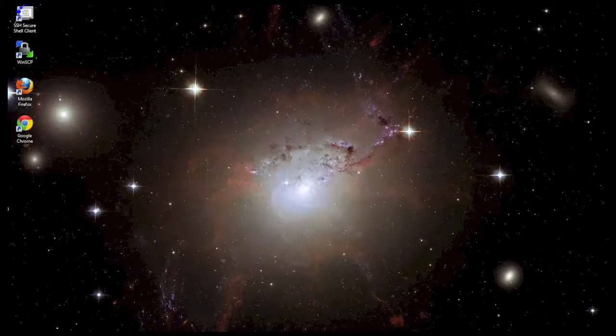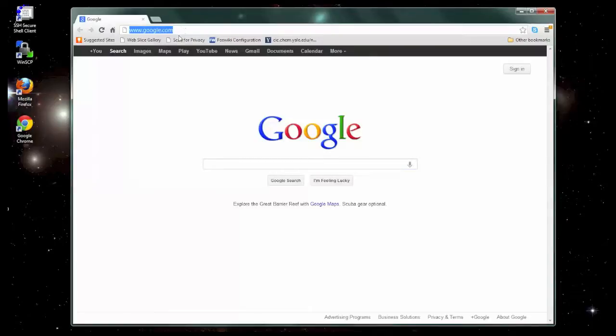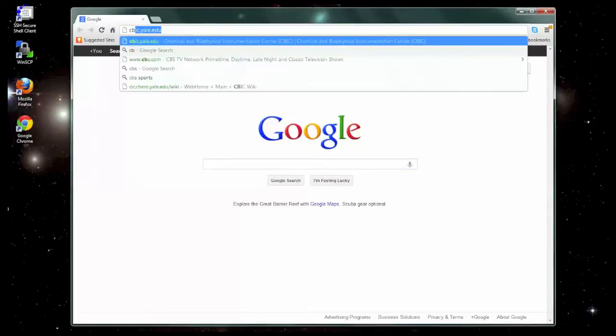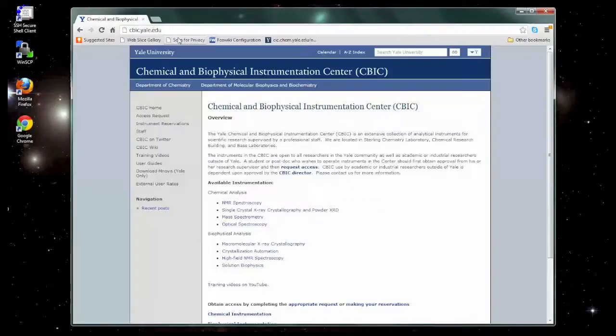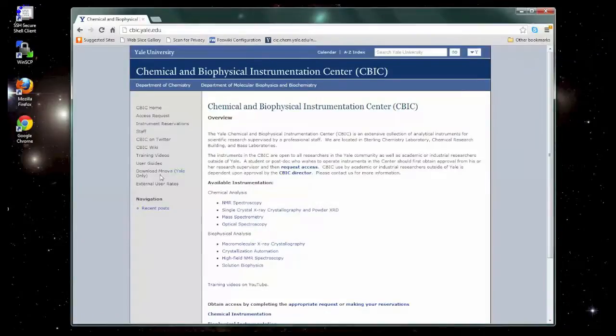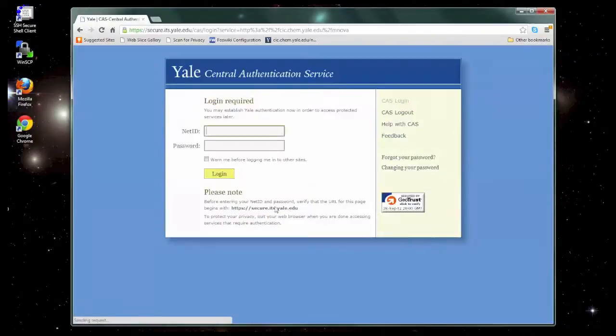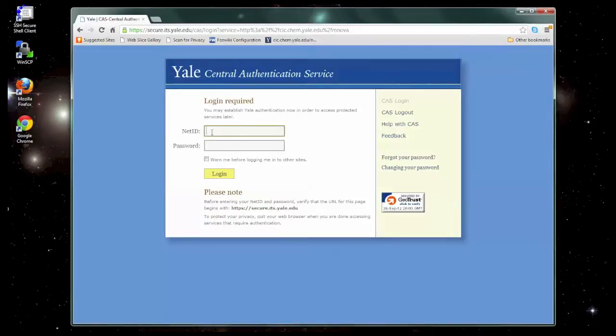First thing you'll want to do is open a web browser and go to the CBIC website, which is located at cbic.yale.edu. Once there, find the Download MNOVA link, which is protected so that only Yale users can access it. Go ahead and enter your YaleNet ID and the associated password.